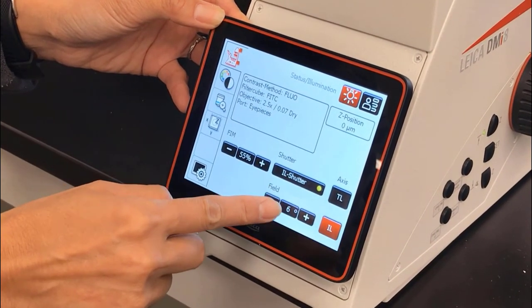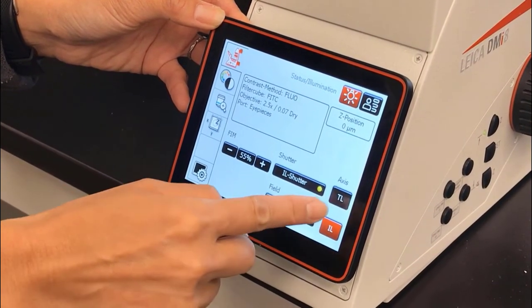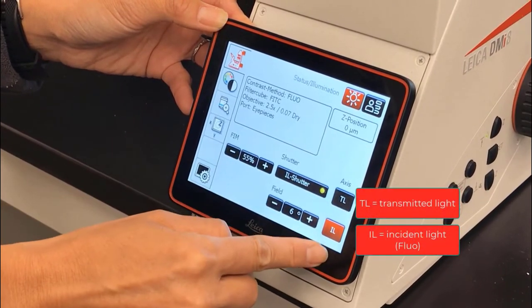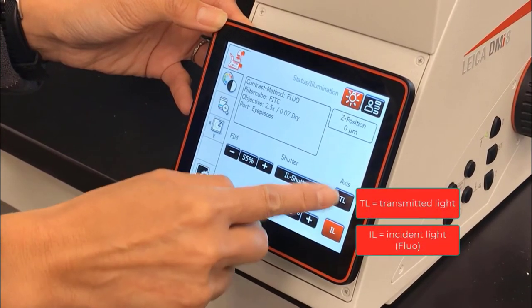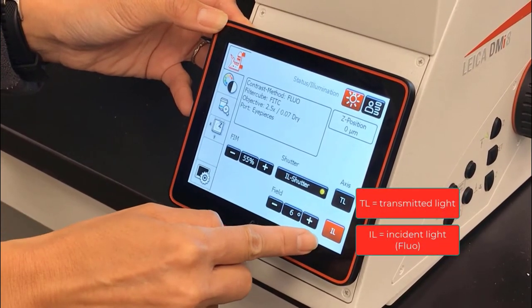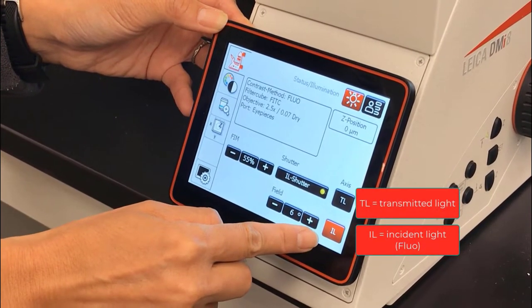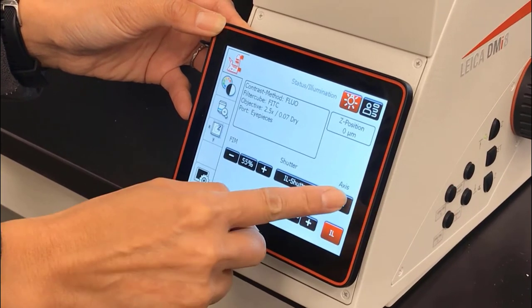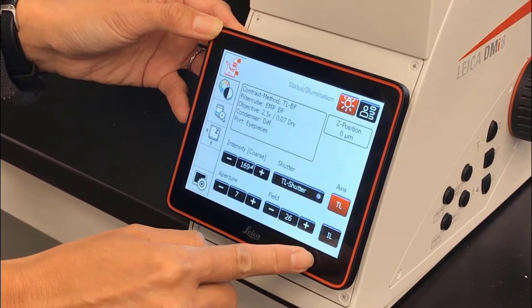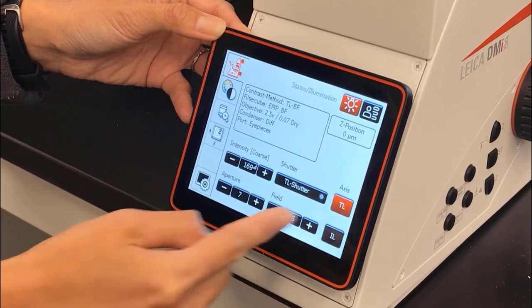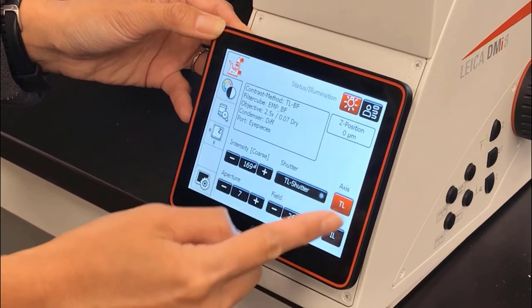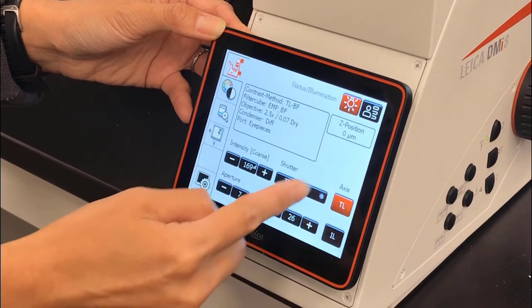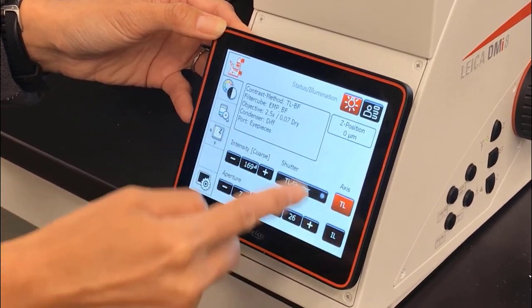We can also toggle between transmitted light and incident light. Incident light is another name for fluorescence. If we switch to the transmitted light, you'll see that the options change in terms of the light controls.